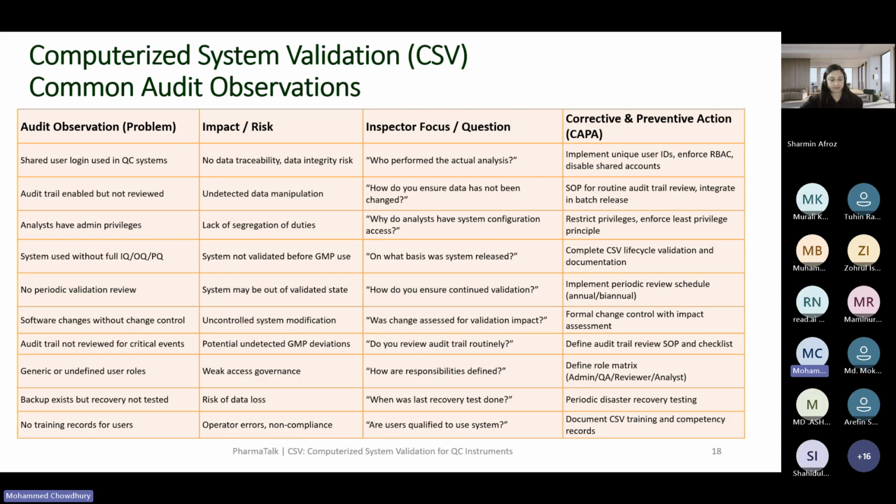Risk assessment can be the GxP assessment for the computer system or instrument classification and high level assessment, and then the functional risk assessment, and also the design specification, functional specification, configuration specification.